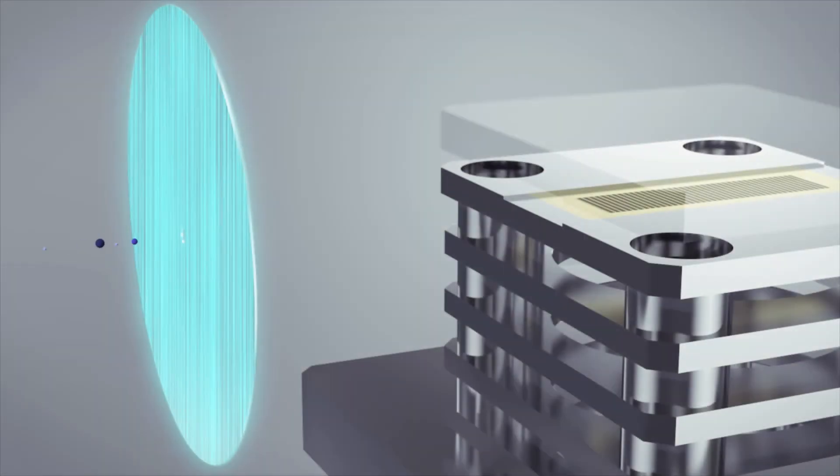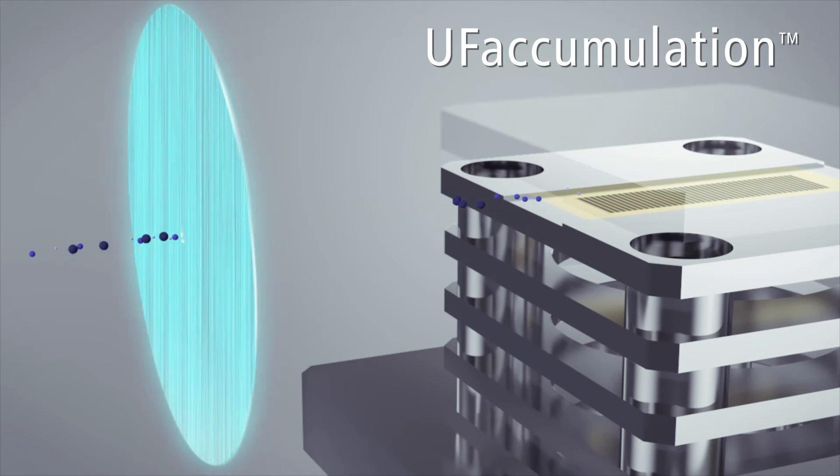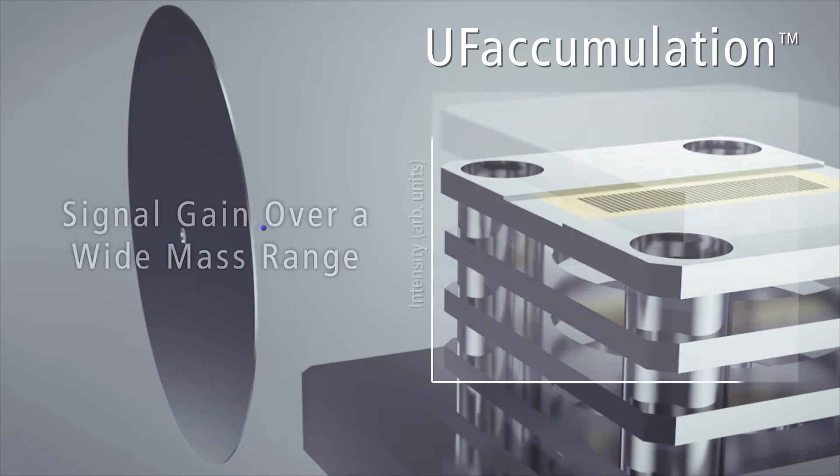Synchronization of ion transfer by UF accumulation helps prevent loss of ions over a wide mass range, for increased sensitivity.